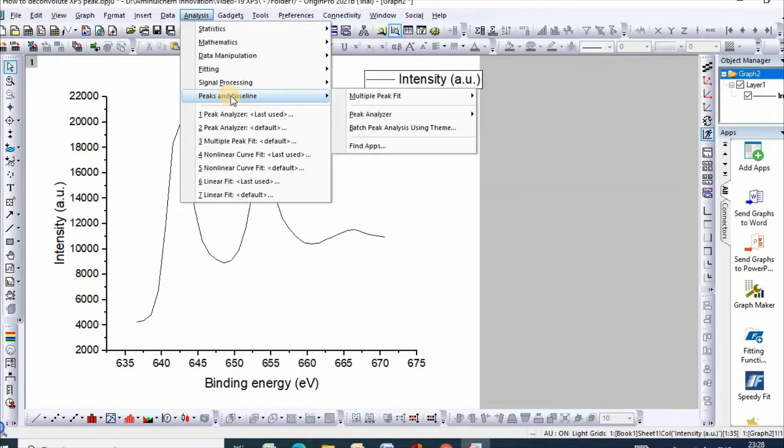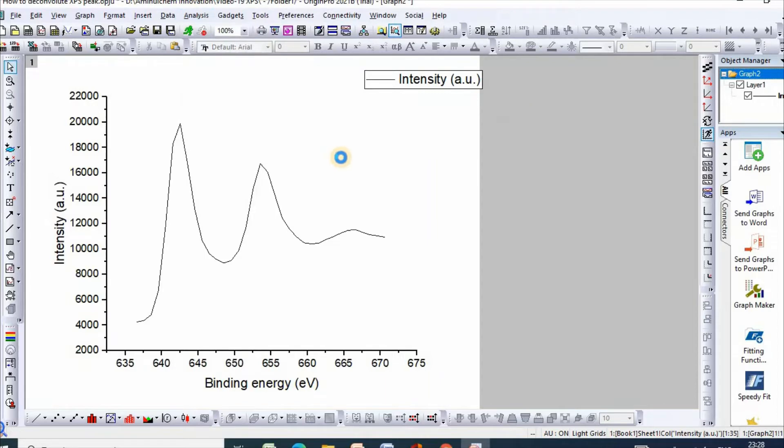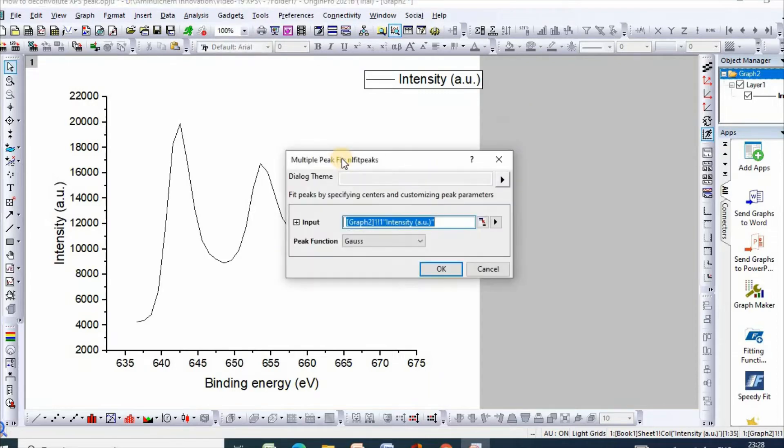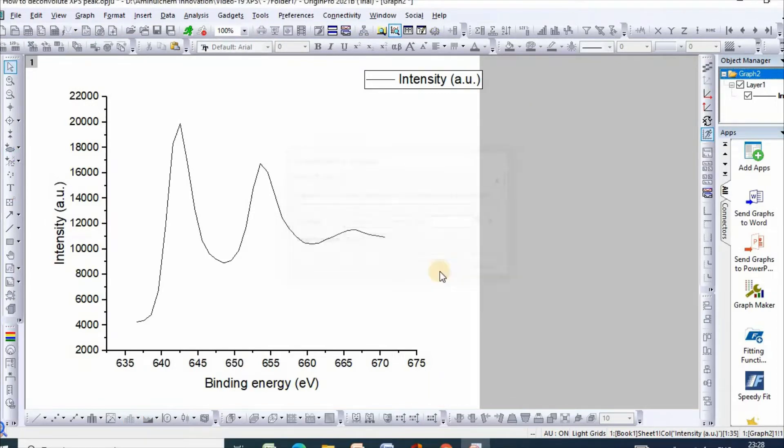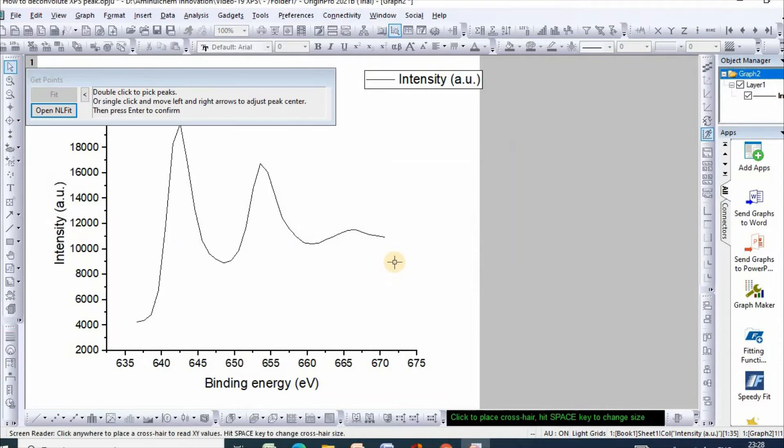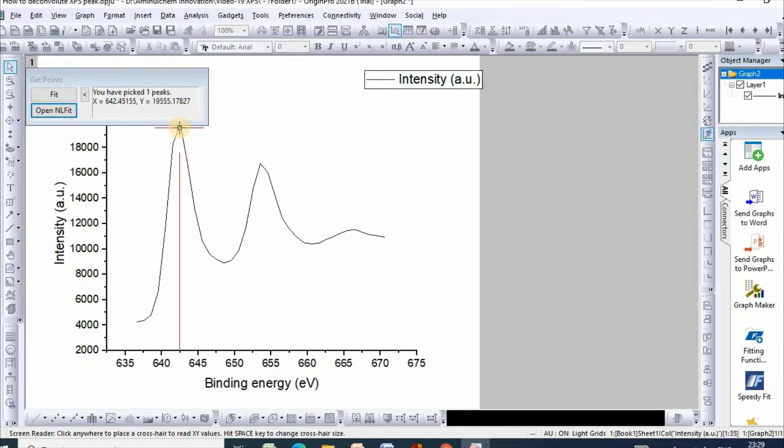Then go to Multiple Peak Fit, open dialog, then OK. Then double-click to Peak Fit, click on here.